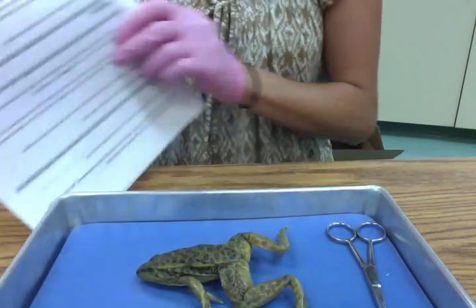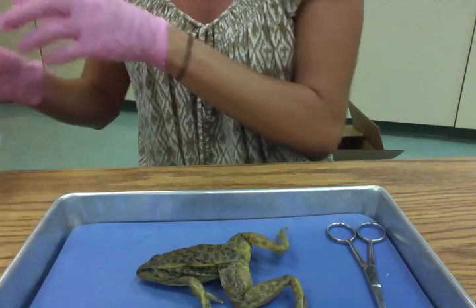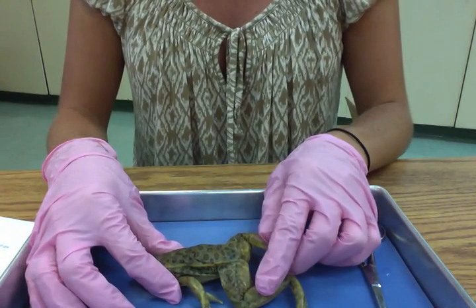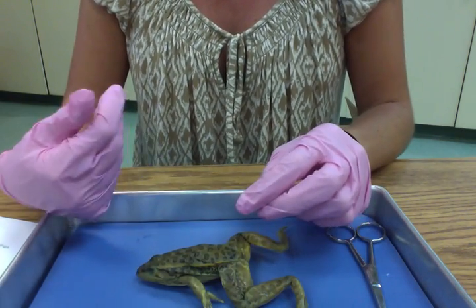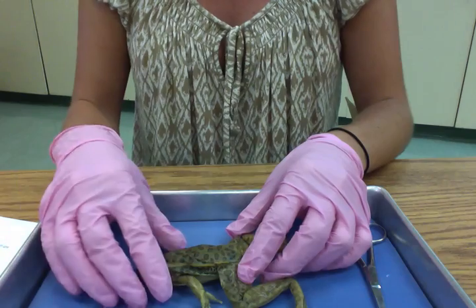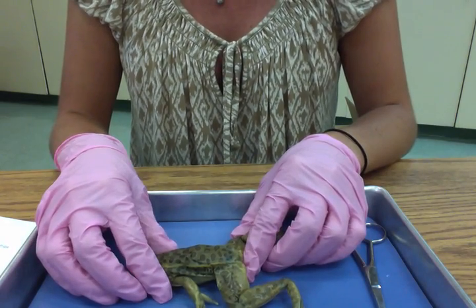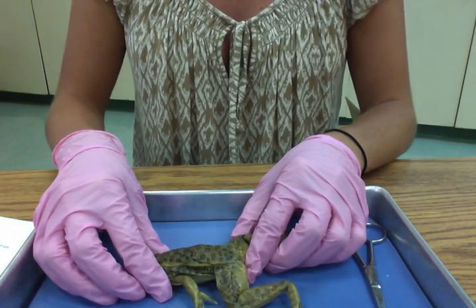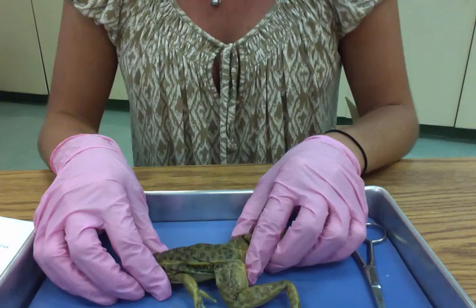So you should all have a copy, a virtual copy of the frog dissection instructions up on your computer, and you'll be watching this video as you do your dissection. Remember that you can always push pause if you have to, especially as you draw the external and internal anatomy. Or if you need something repeated, you can always go back. Please do me a favor and read through your copy of the instructions before you watch the video any further. That way you know what you're expected to do and what I'll be grading when I look through your science notebook.